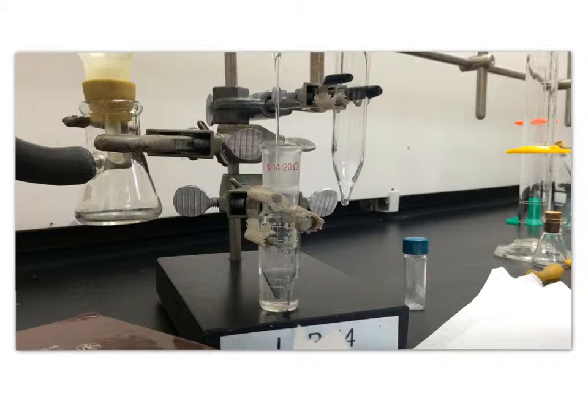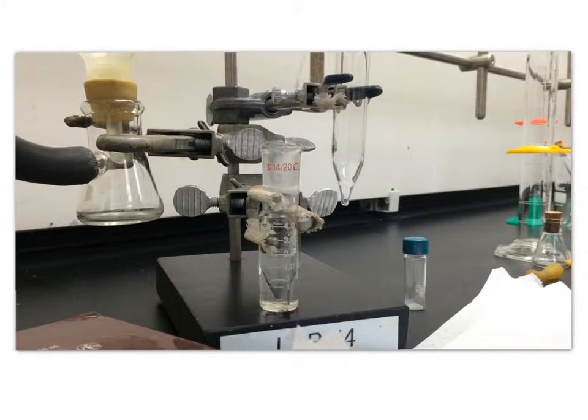In order to separate the initial mixture and test for a base, a 5% HCl solution was used to react with the base. Since an acid and a base form a salt in water, the idea was that the hydrogen ions would bond with the organic base at its polar end and make it soluble in water. Then this aqueous solution of chloride ions and the organic base would be transferred to a separate centrifuge tube where a 10% NaOH solution was added for back extraction.